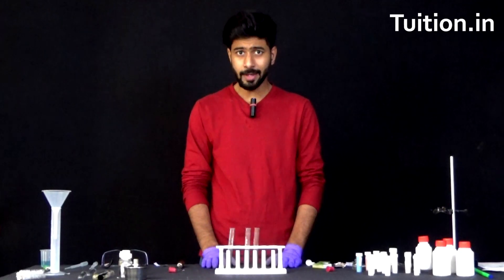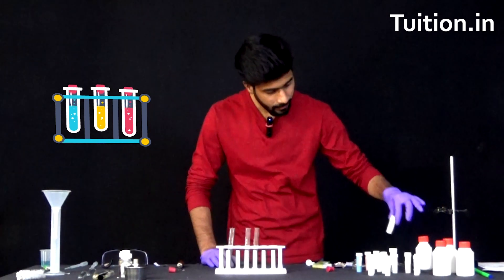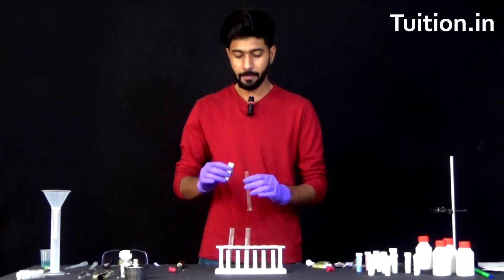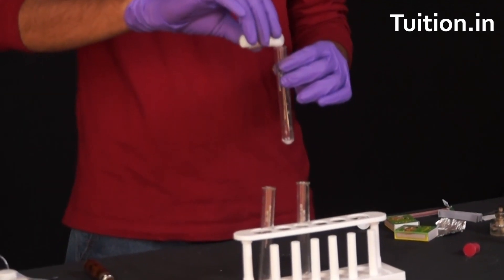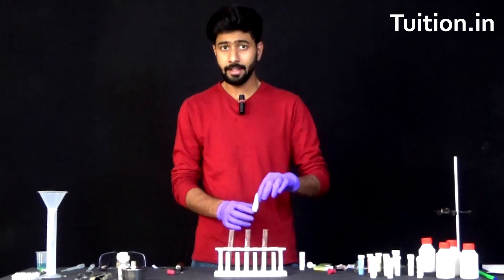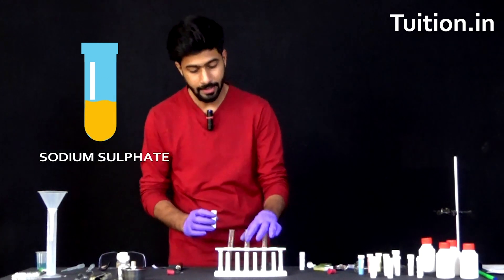In this experiment, we will be needing three test tubes, one test tube stand, a little bit of barium chloride salt. Let's put some of the barium chloride in our test tube. Next we will be taking sodium sulphate solution and we will be adding some of it in the other test tube.